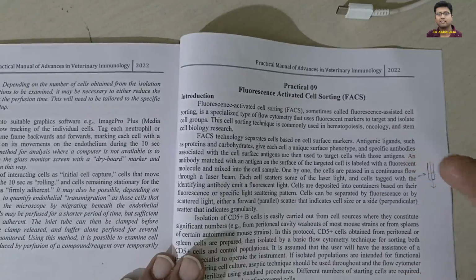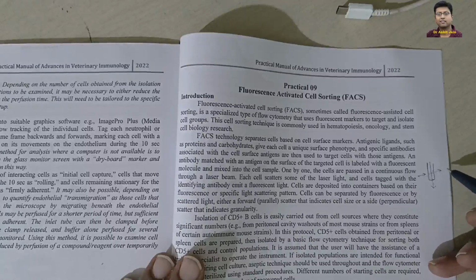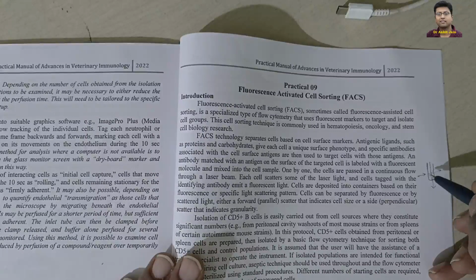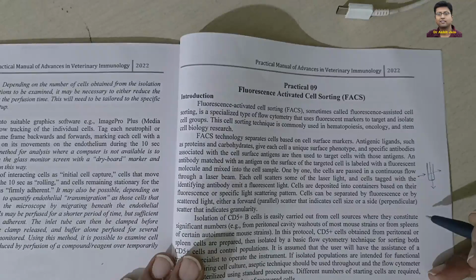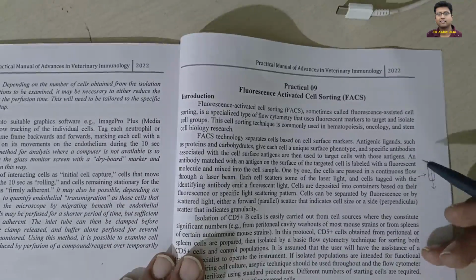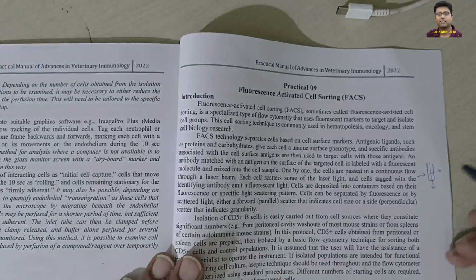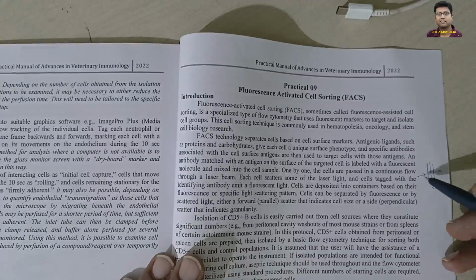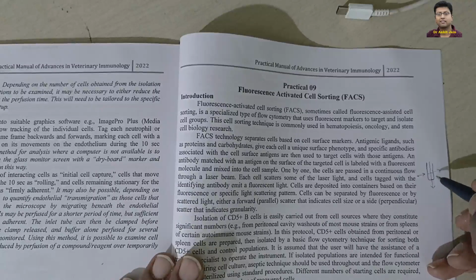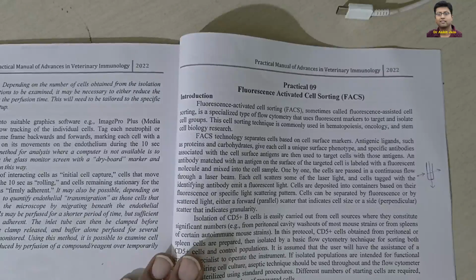So there are two things: when the light passes through the cell and it is scattered, it measures cell size, and when light passes into the cell and refracts back, it measures the granularity of the cell. So for example, the neutrophil is more granulous than the B cell. So definitely, if there is more scattering and more perpendicular refraction, it measures the granularity of the cell.